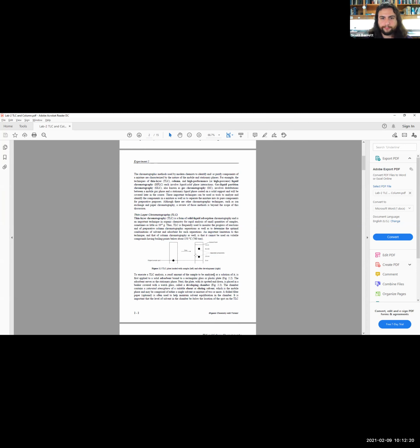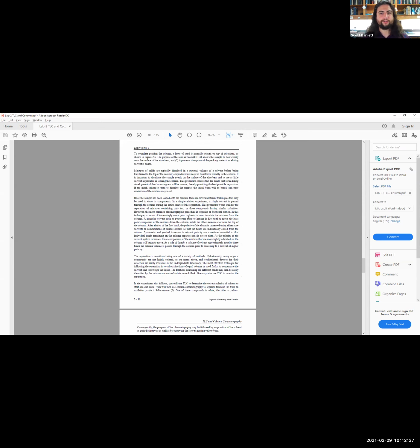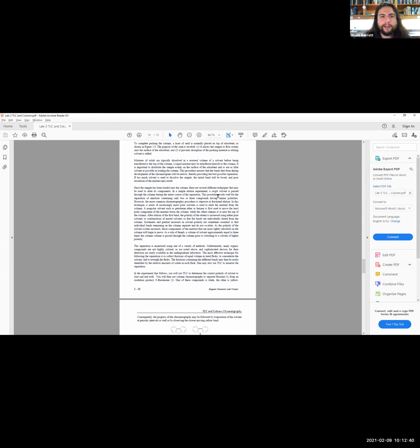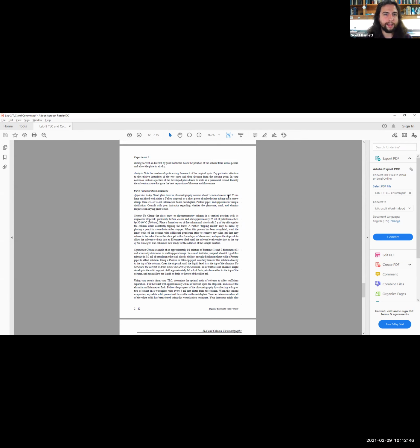I mean, but my question is, isn't it always going to be 2? That's relative to how many compounds you have in your mixture. Right, but in this particular example, we're always using the 2, aren't we? Yeah, I think that they're just making sure that you quantify the numeric amount, so that way you understand the concept that they're placing in front of you. So yeah, if you had a compound or a mixture that had 4 compounds in it with different polarities, then you'd have 4 spots. So yeah, in this example, it's 2. Okay. I'm just not super sure how to fill this one out.